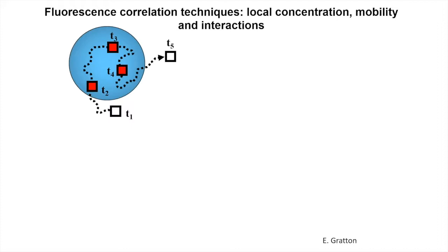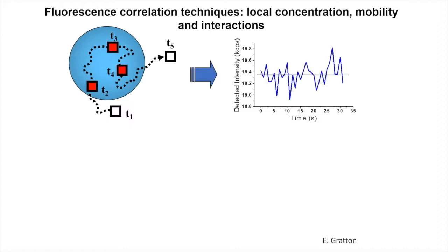So you park the confocal beam, which is essentially a diffraction-limited spot, anywhere on the cell, on the membrane, somewhere inside the nucleus or cytoplasm, and you watch fluorophores coming in and out of the confocal volume. And that creates fluorescence fluctuations. This is usually a single molecule technique that works on a small population of molecules. In other words, if you overexpress something, you're not going to see this because there's not going to be much fluctuation going on. But a small number of molecules coming in and out of your confocal volume will create these fluctuations, from which you could generate this autocorrelation curve.